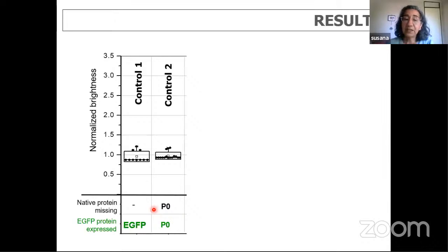So we will take it every day. And we will always take P0 labeled yeast that will also have a brightness of 1. So then all the samples taken that day will be comparable to these two controls, and then assigned the brightness of 1 of that day, and then we can compare with the following day. I hope you understand what I said.